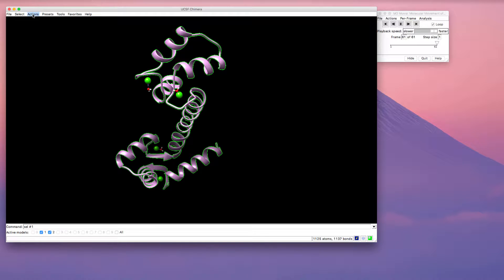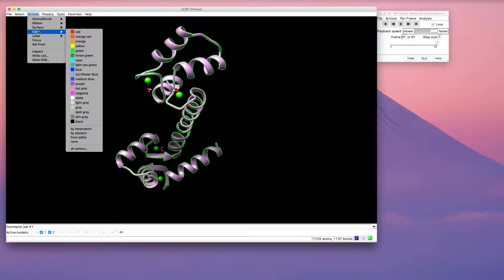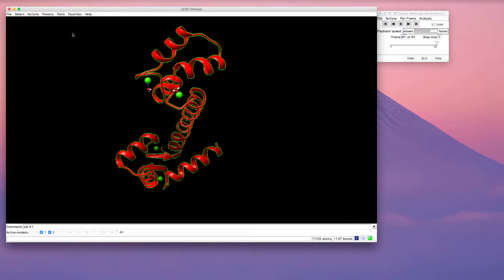So one way you can do this is just go to actions, color, and I could turn this red if I wanted to. Another thing you can do is you can make the color transparent.